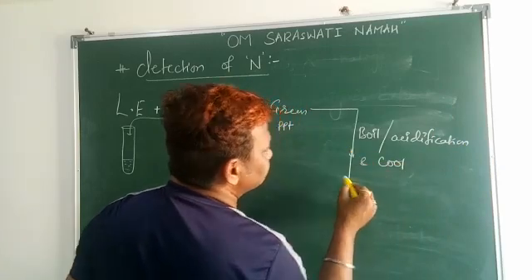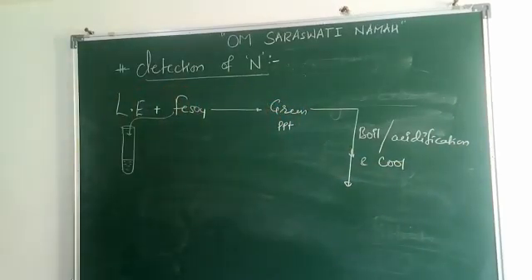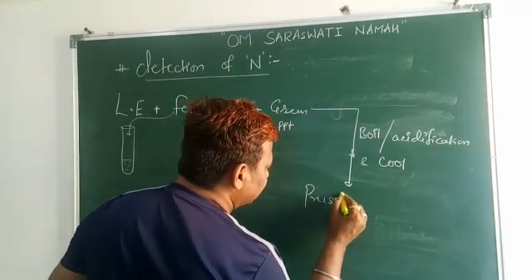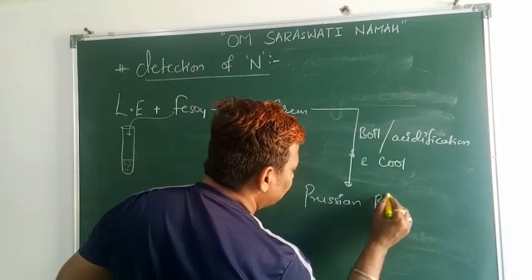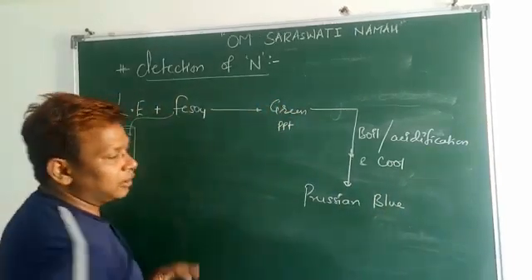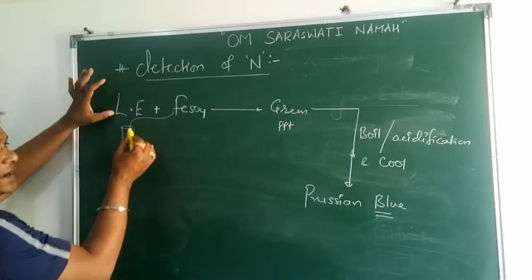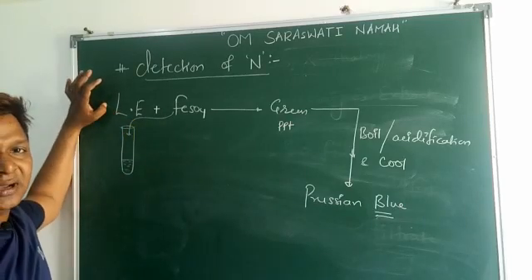While doing this process of boiling, acidification and cooling, the color of the solution converts from green to Prussian blue.